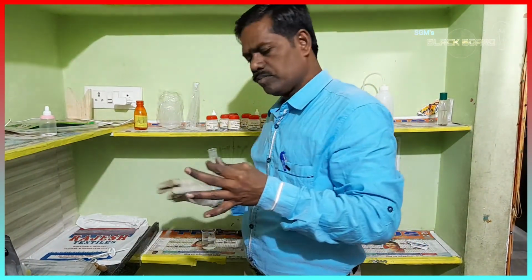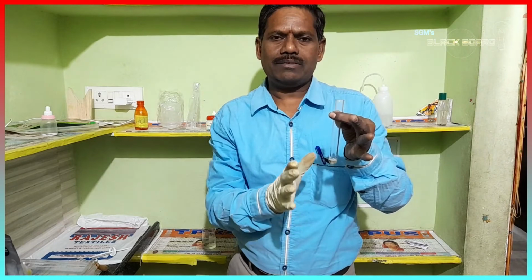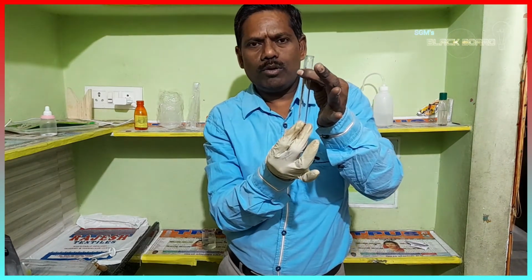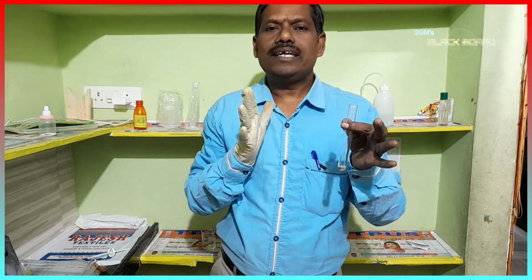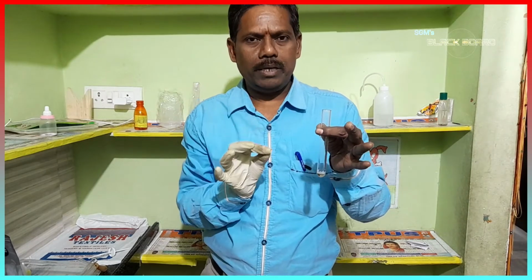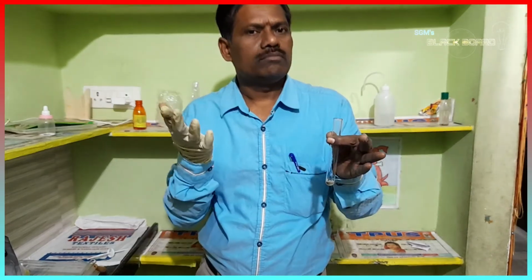So here, when sodium chloride reacted with sulfuric acid, it produces HCl gas, hydrogen chloride gas. With dry litmus paper, this hydrogen chloride gas does not turn the blue litmus paper red.